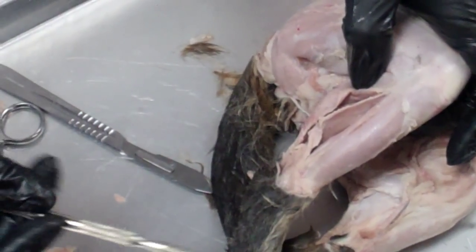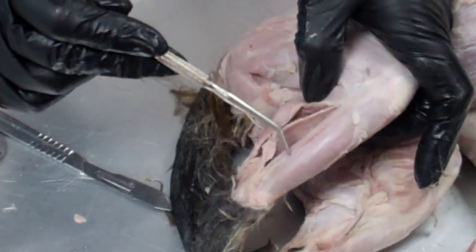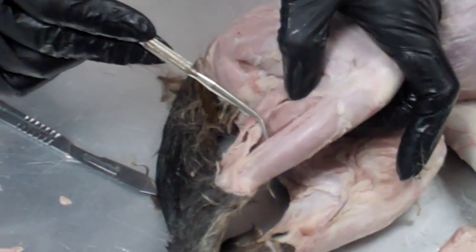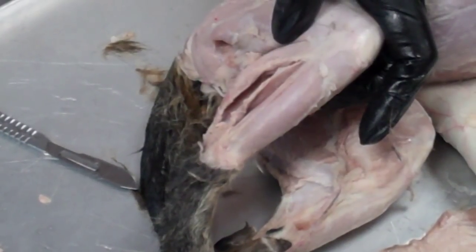So those are the muscles you need. From the front: tibialis anterior, extensor digitorum longus, peroneus muscle, soleus muscle, and gastrocnemius muscle.